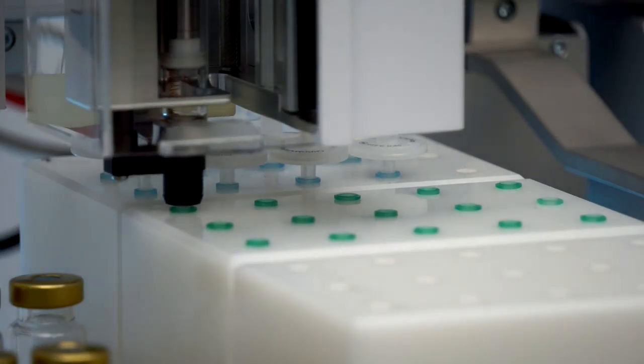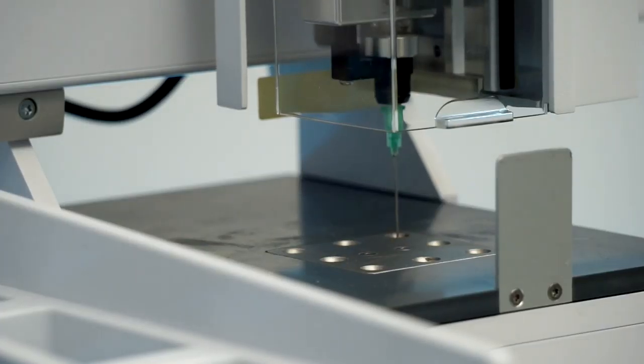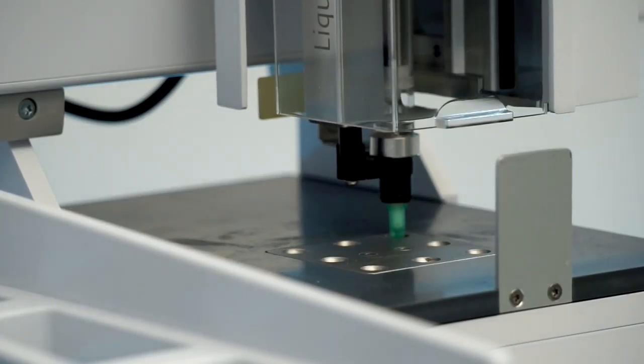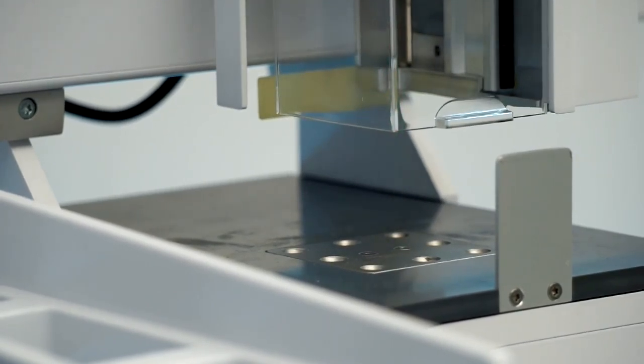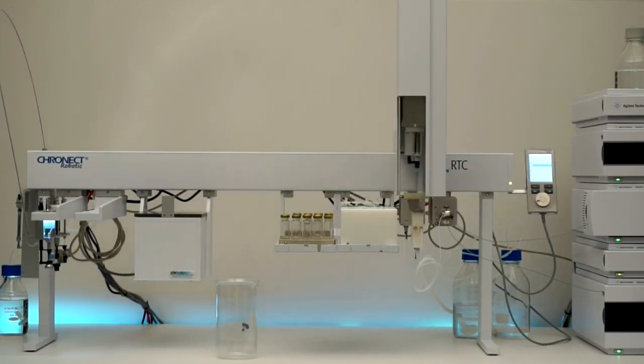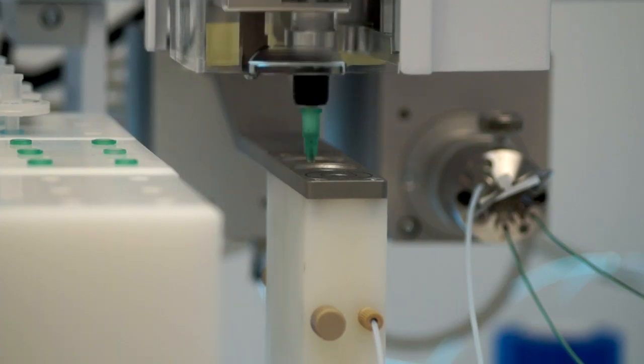The liquid tool now takes back the syringe needle that was already used for eliminating the pressure from the sample and ejects a defined amount of extract which is still contained inside the syringe into the 2 mL extract vial situated in the ultrasonic bath.